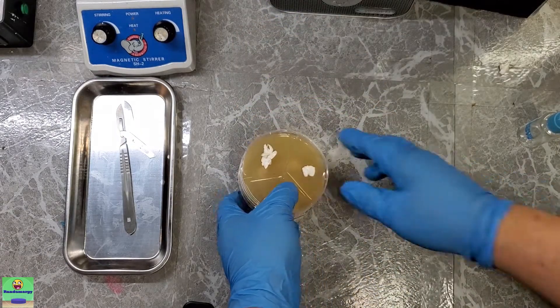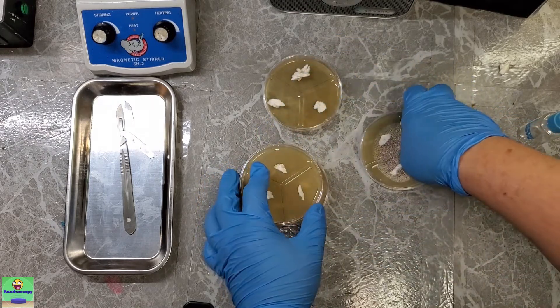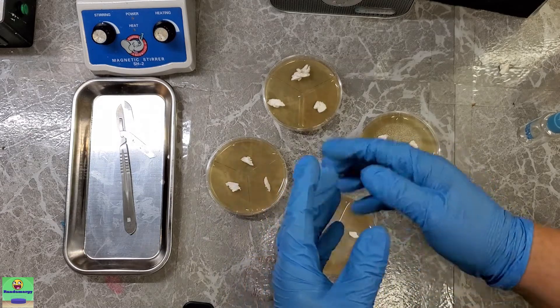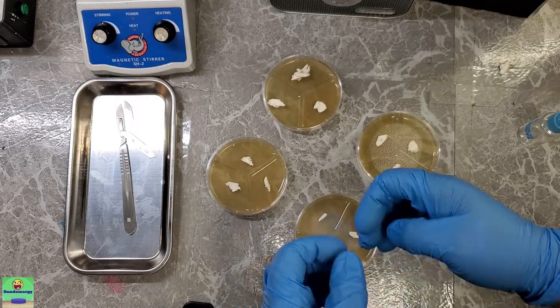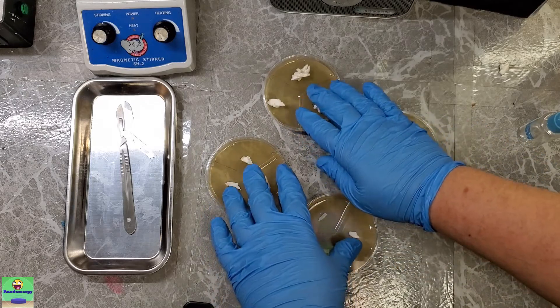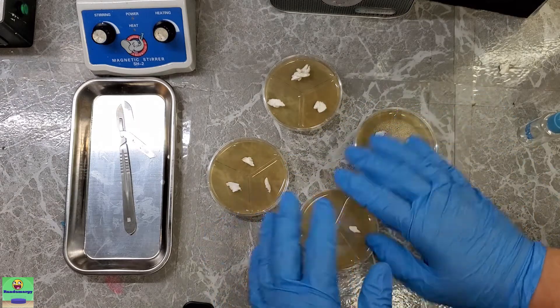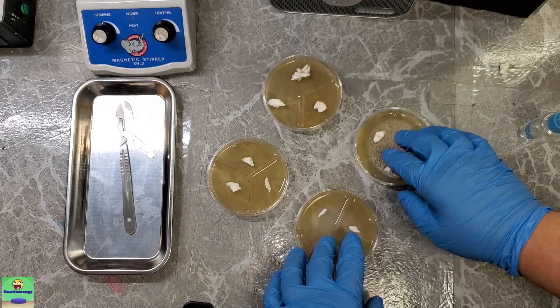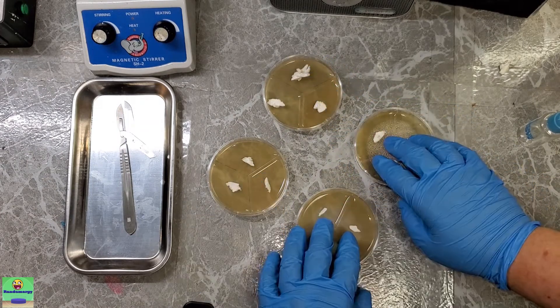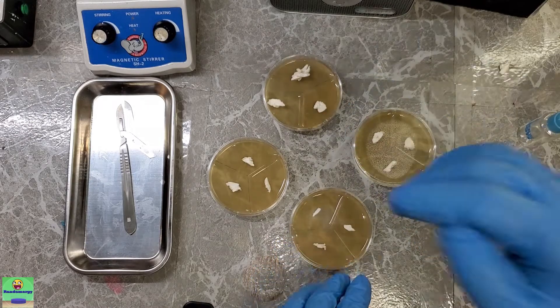These petri dishes we just inoculated all have a decent amount of mycelium from that grow kit in them. I'm going to wrap these in parafilm — a really nice semi-permeable membrane that allows exchange of fresh oxygen and lets excess carbon dioxide out while keeping most of the moisture within the petri dishes. Petri dishes wrapped with parafilm will dry out eventually, but it prolongs the moisture content so much longer than leaving them unwrapped. After wrapping, I'll put them in an incubator at about 25 degrees Celsius.